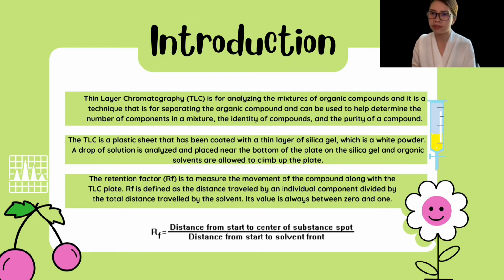purity of a compound. This TLC is a plastic sheet that has been coated with a thin layer of silica gel, which is a white powder. A drop of the solution to be analyzed is placed near the bottom of the plate in the silica gel, and organic solvent is allowed to climb up the plate.